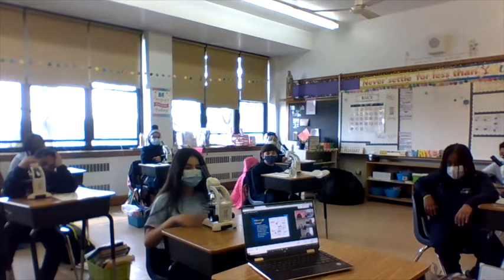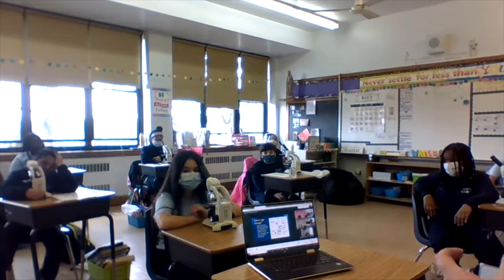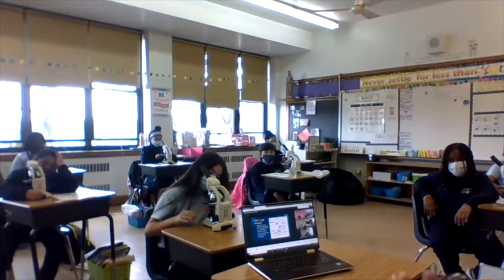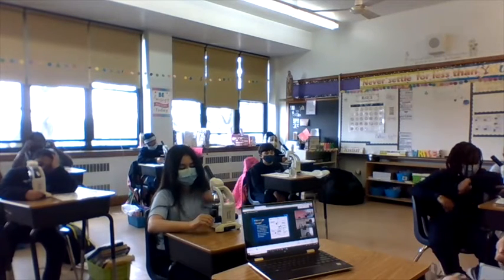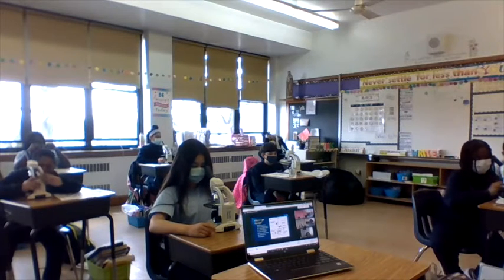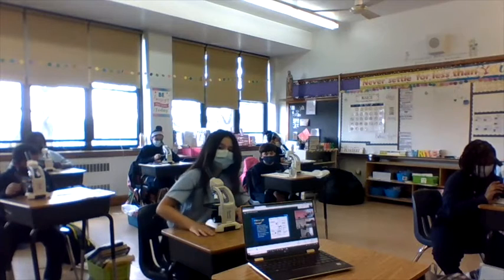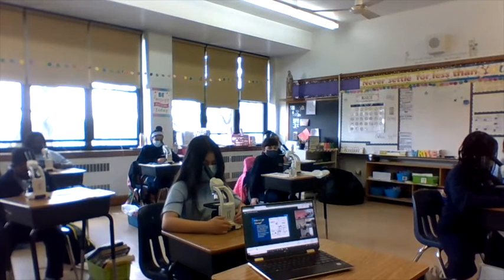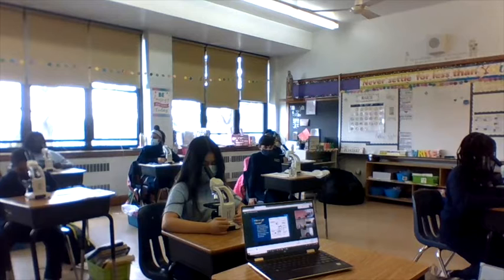So remember the steps when you're going to look at your specimen: everybody starts on red, and we're carefully moving the lenses, right? And you're carefully moving the knobs. All right, so you can explore your plant specimens. I'll give you about 5 to 7 minutes. Think about what you notice, make observations. You could turn and talk to your partner about what you see from a distance. All right, go ahead.